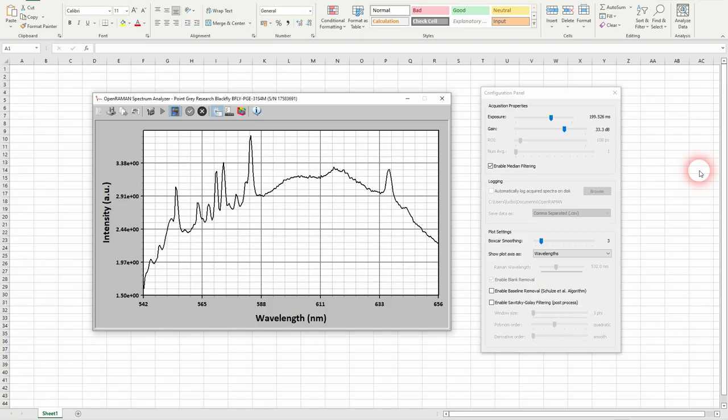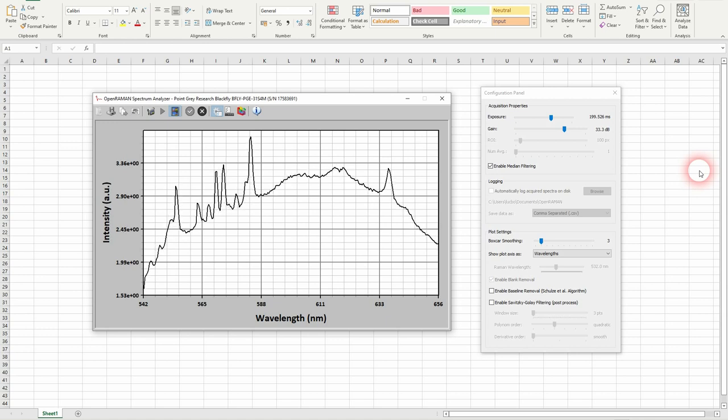So this is just right enough to take a spectra but we don't want to take a spectra with that much gain because that's way too noisy.